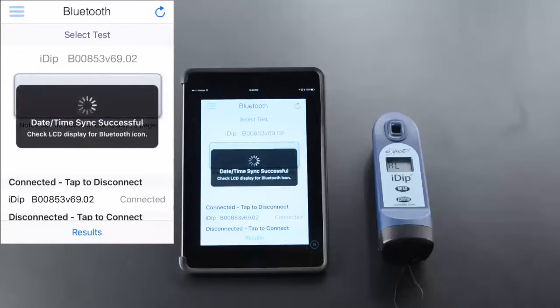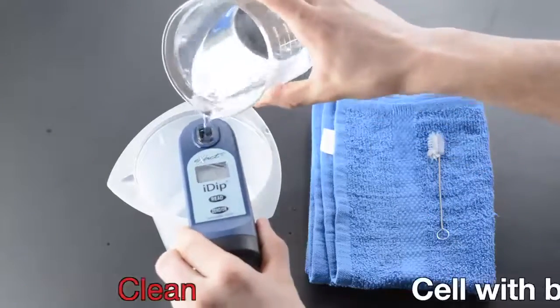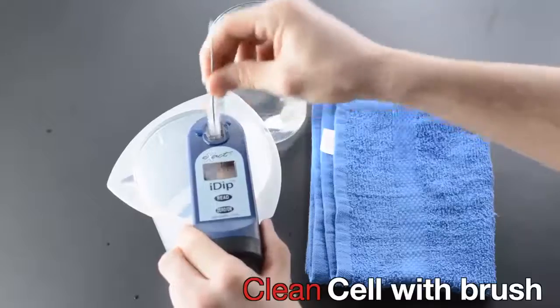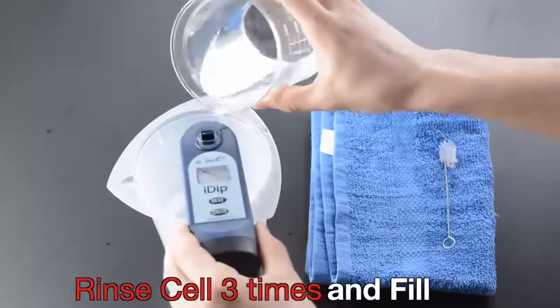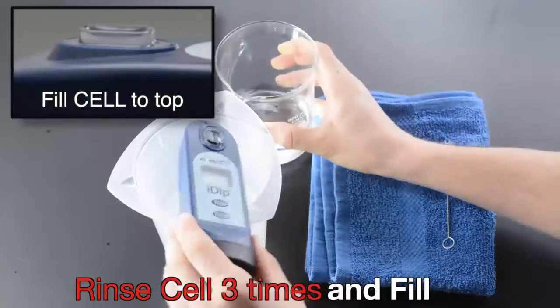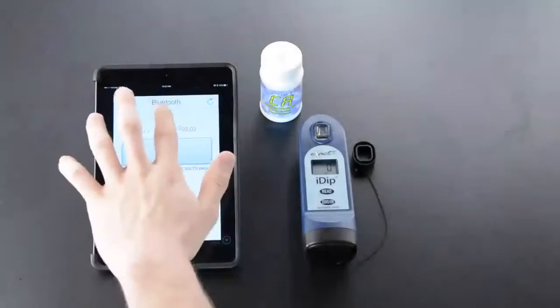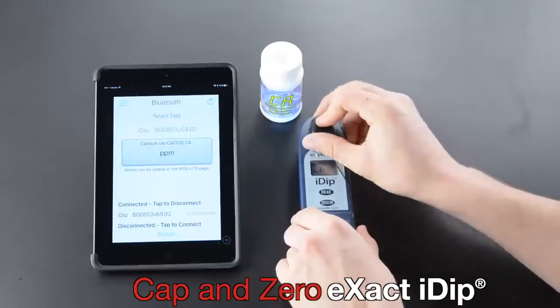Clean the cell with a brush, rinse the cell three times, and fill the cell to the top. Select the test, then cap and zero the eXact iDip.